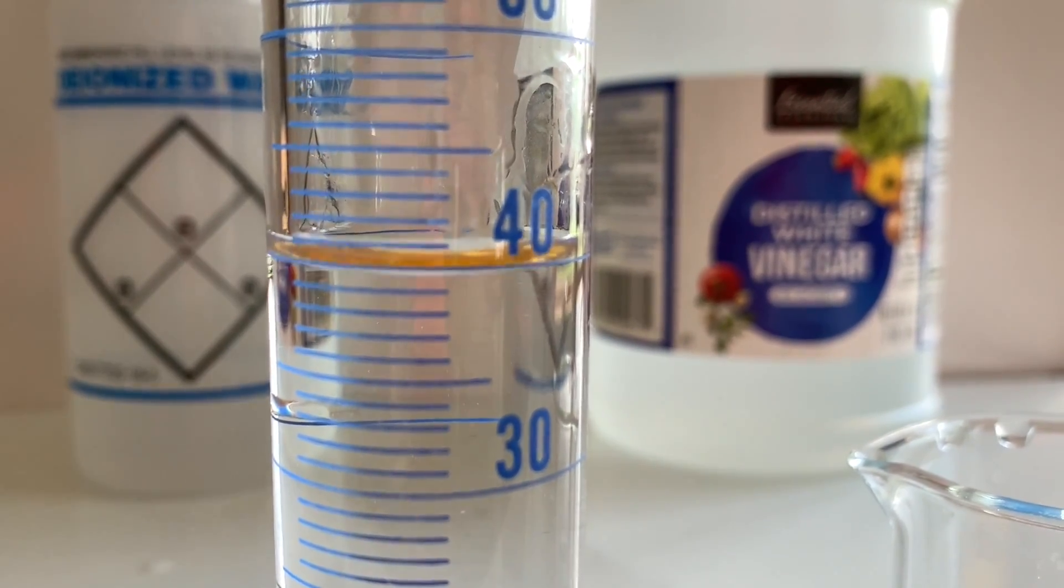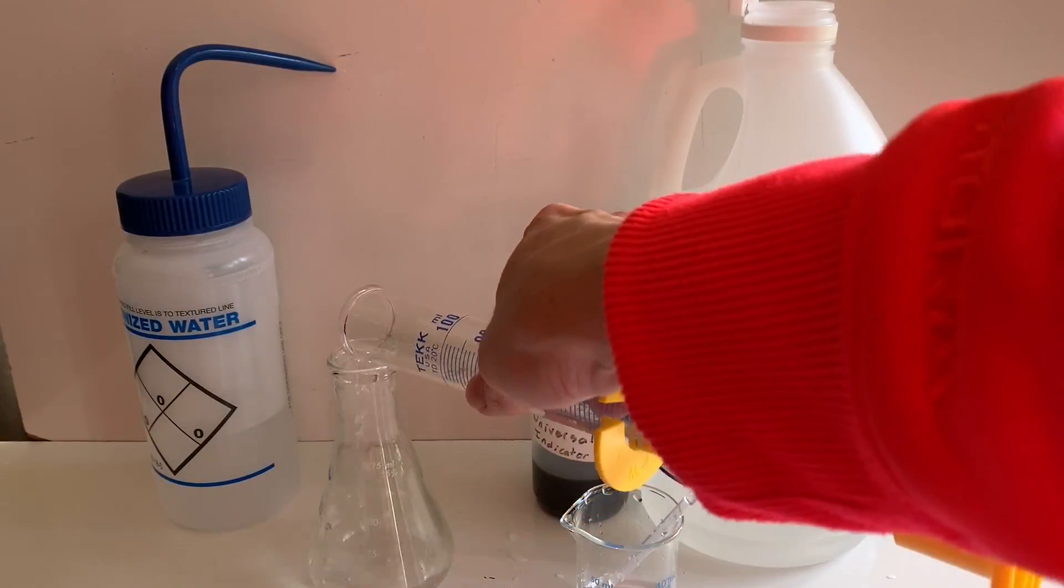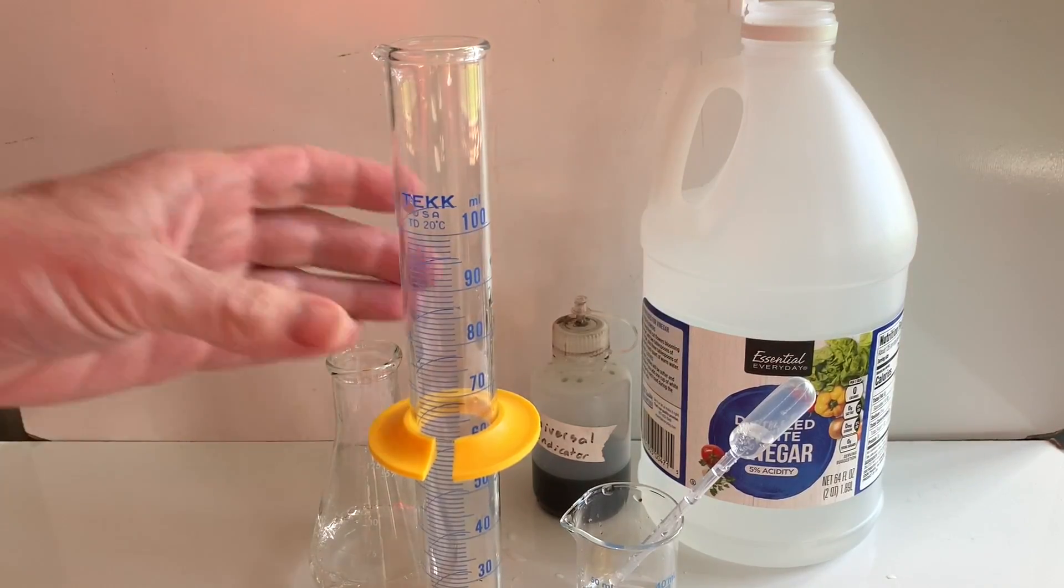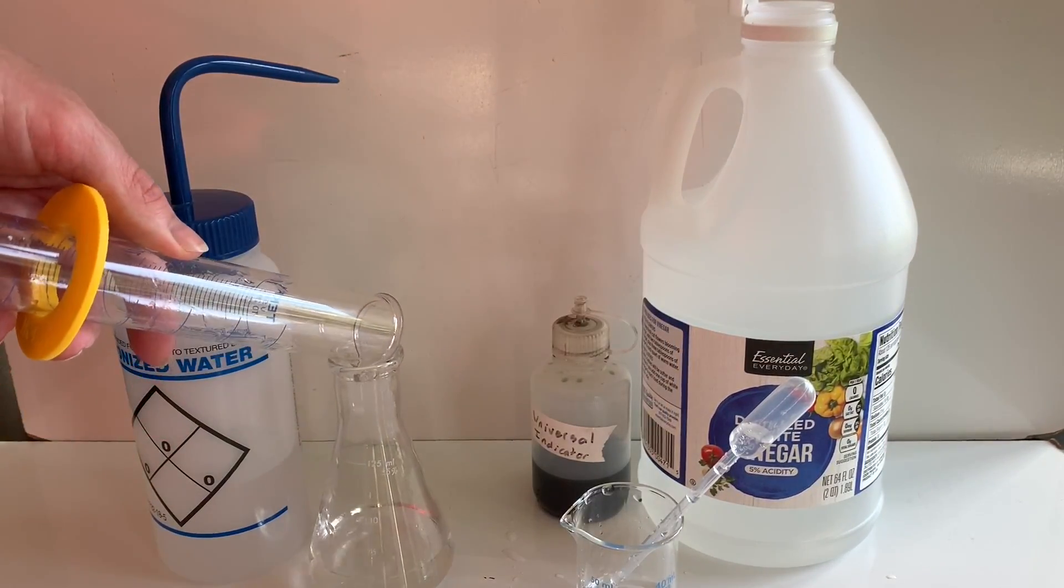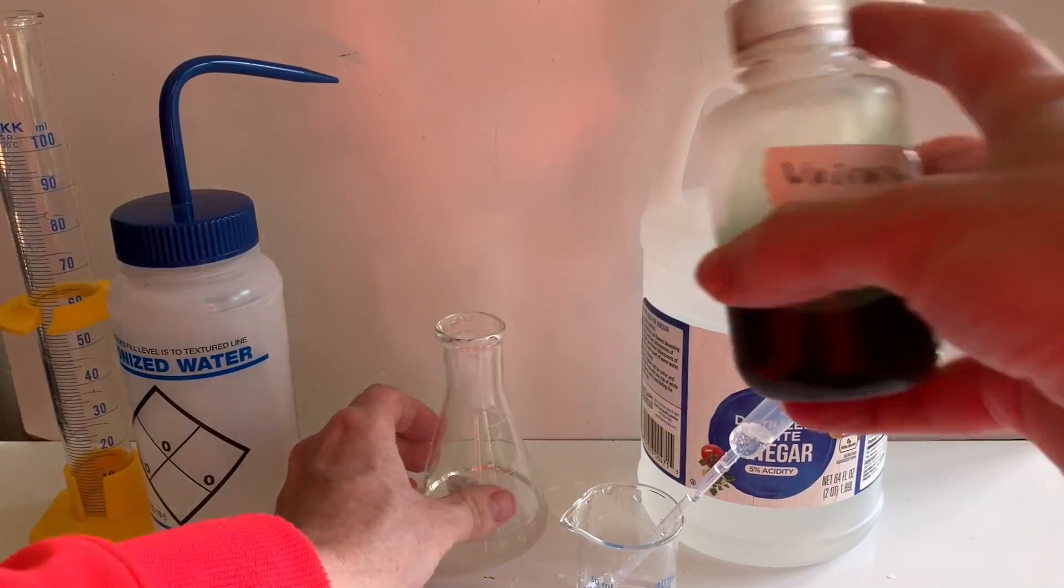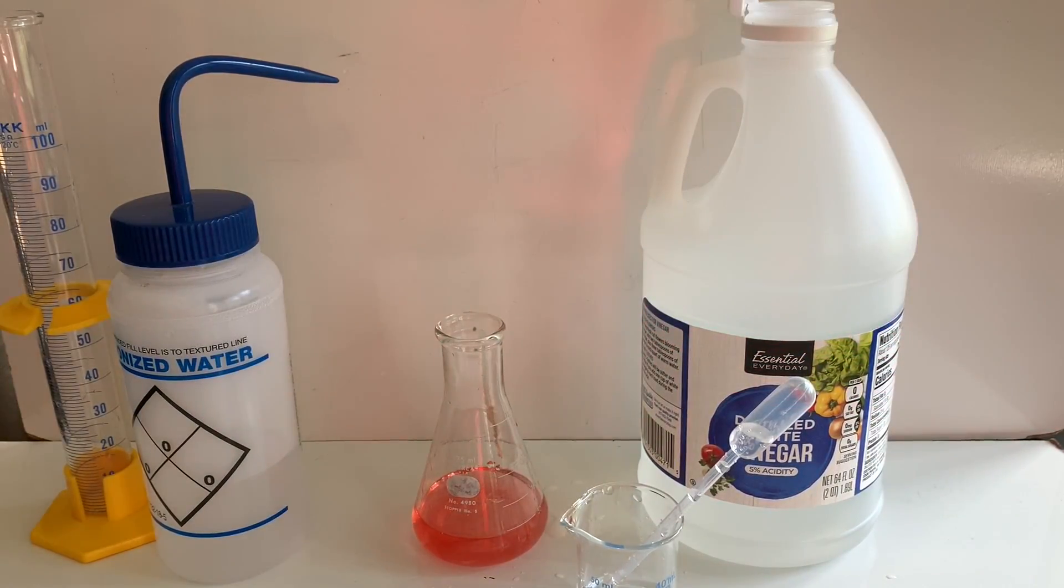The 40 milliliters of the vinegar or acetic acid solution was placed in an Erlenmeyer flask and then I rinsed the graduated cylinder to make sure that all the solution that I measured of the vinegar went into the flask. I added universal indicator which turned red, showing again that vinegar is definitely an acid.